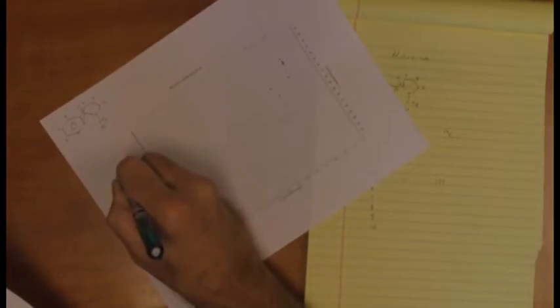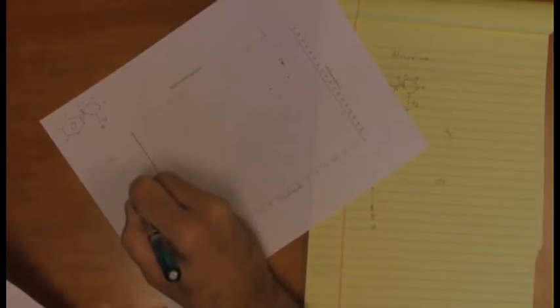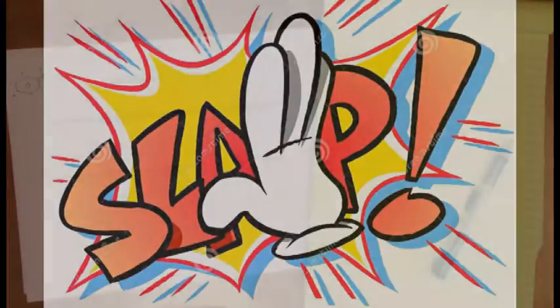CH2, CH2, CH3, CH2, CH, solvent, CH, CH, quaternary, CH, CH. There. All right, now we go after some of the obvious peaks in here, and there are some that should be just so obvious they just reach out and slap you in the face.